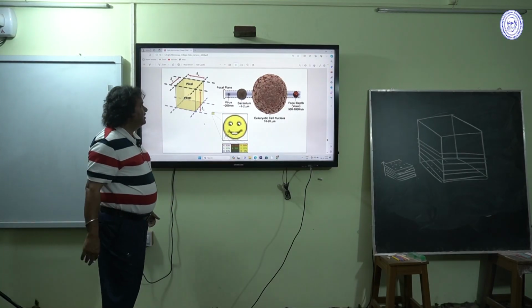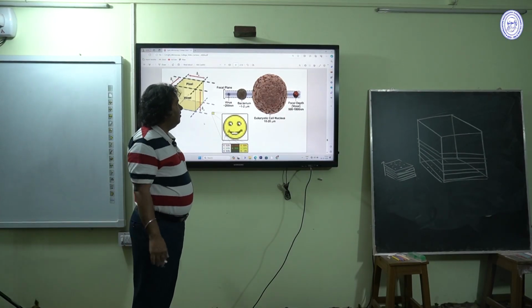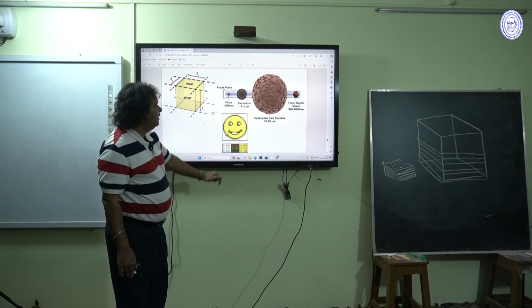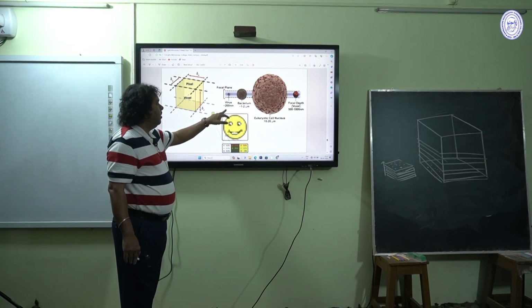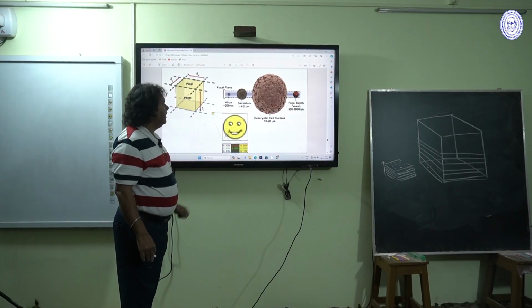Okay, and this is the 3D imaging of a eukaryotic nucleus, where the focal depth, that is voxel, is 500 to 1000 nanometer. Here it is bacterium, 1 to 2 micron, virus near about 200 nanometer.